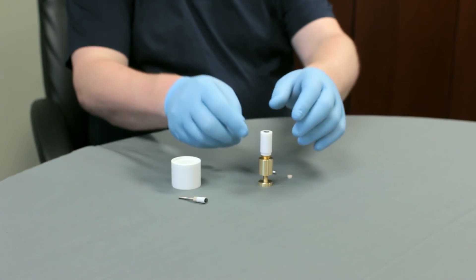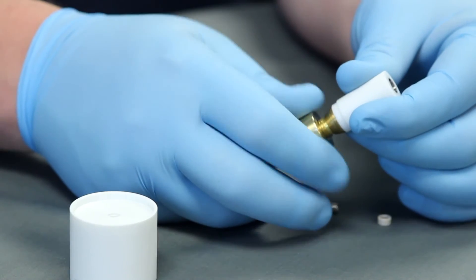Now let's continue to reassemble the tip for use and remove the tip from the disk core ejector.